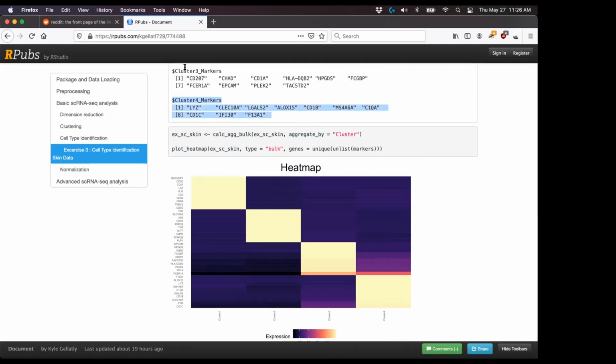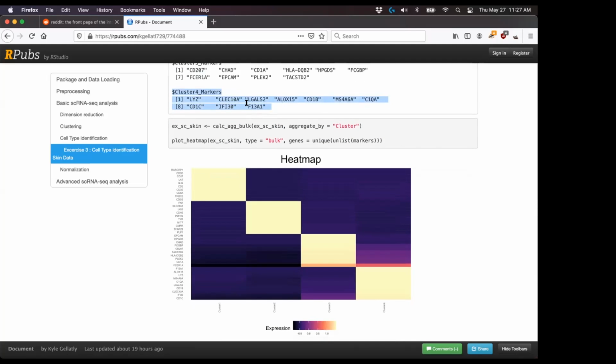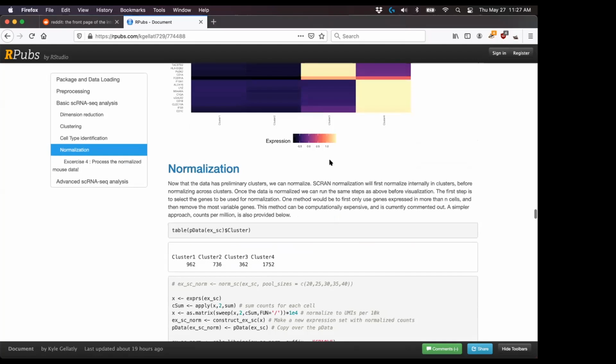They're very similar to a dendritic cell, but they have genes like CSF1R and LYZ and a lot of cytotoxic, killing molecules, so we thought of them as some type of macrophage, whether it's type 1 or 2. I can't remember the distinguishing features for macrophages. Not sure, but that's what we have as a coarse cell type.